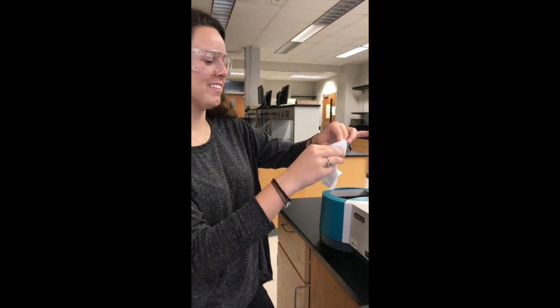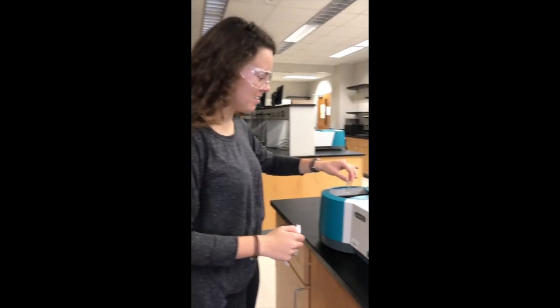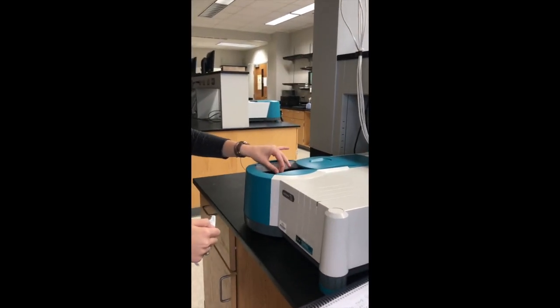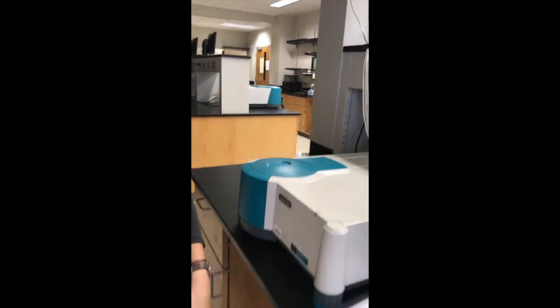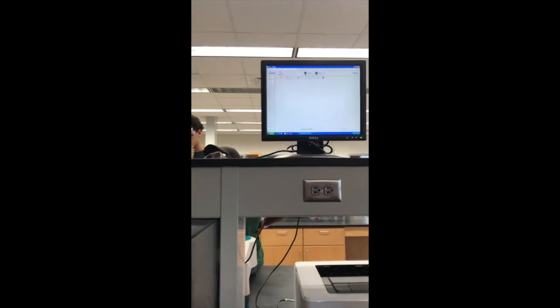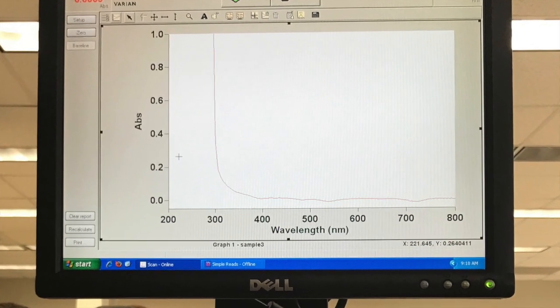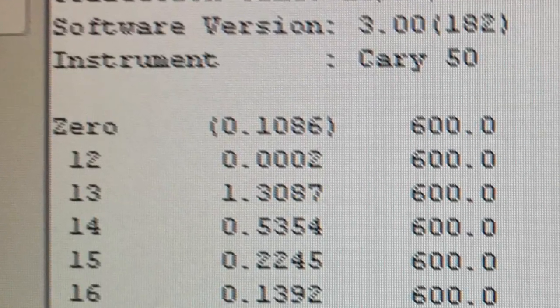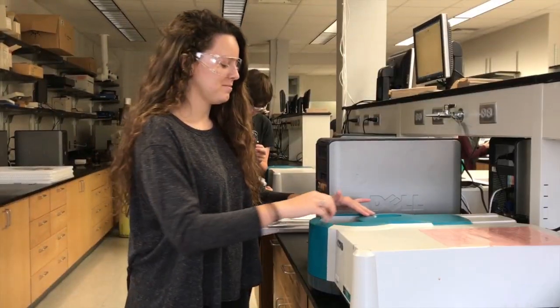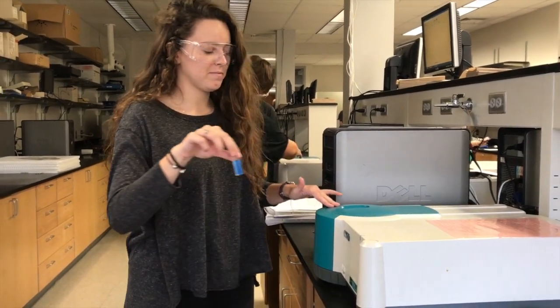You must then take your cuvettes to the spectrophotometer in room 360. The first thing you should do there is place your blank into the spectrophotometer after you wipe the 2 sides. Then use the programs on the computer to zero these programs to make sure that the absorbances you record for each concentrated solution are accurate. When you are sure the programs are zeroed, remove the blank from the spectrophotometer.